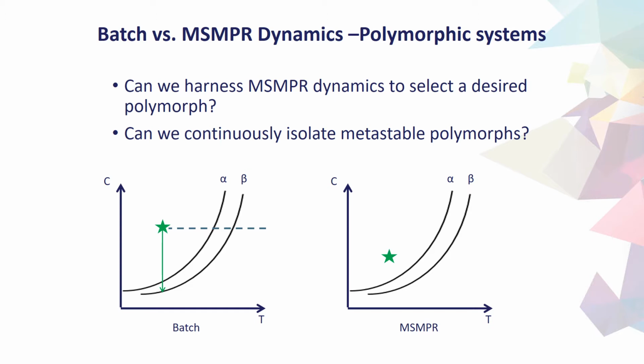So as outlined, there had been previous work prior to the recent spurt of development on continuous crystallization technologies for commodity chemicals. However, really none of these studies considered polymorphism, as these very small molecular weight, often inorganic compounds, did not experience significant polymorphism. So this was kind of an open question that had to be figured out through research, and ultimately the answer was yes, it can be controlled. And this is particularly interesting in the case of MSMPRs.